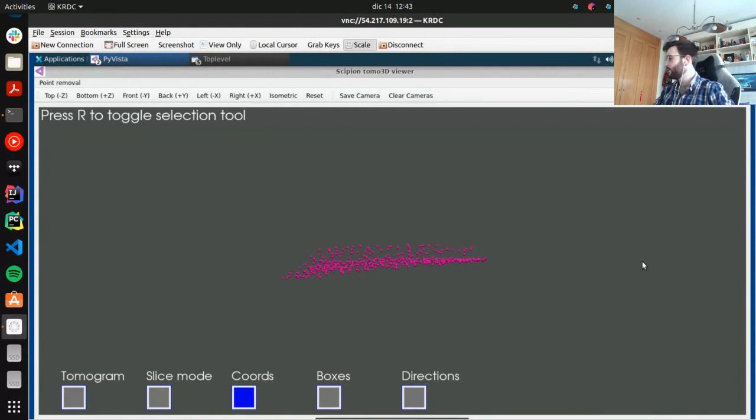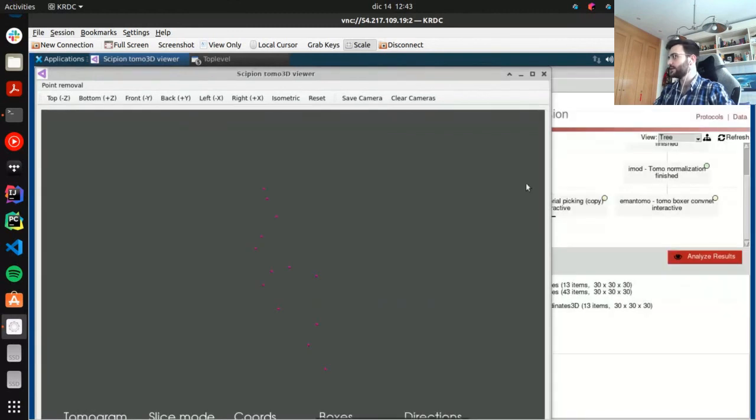So this is one of the viewers. We also have the one of Eman and the one of Dynamo that are very similar, in fact the same as the interfaces we have just seen, with the same controls, with the same way of modifying particles and so on.